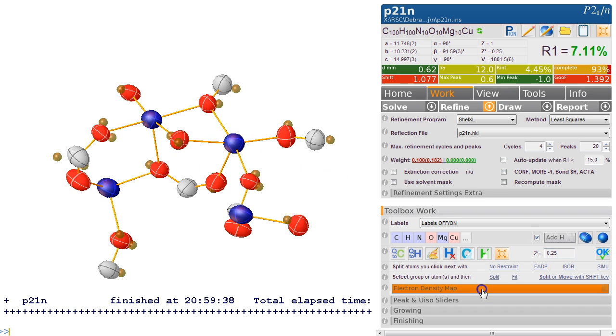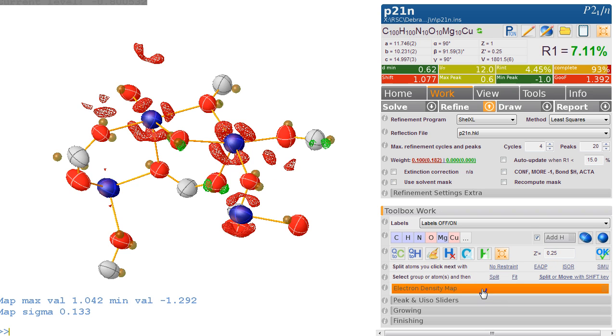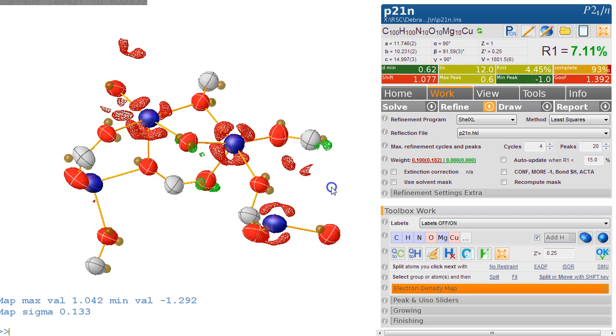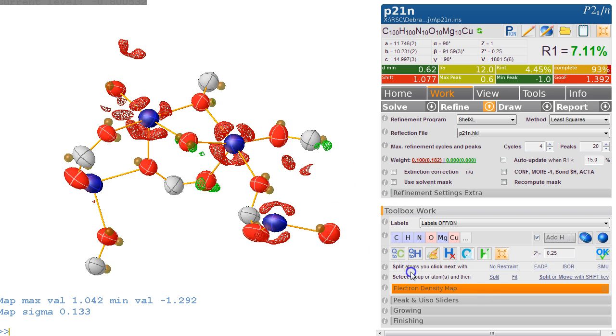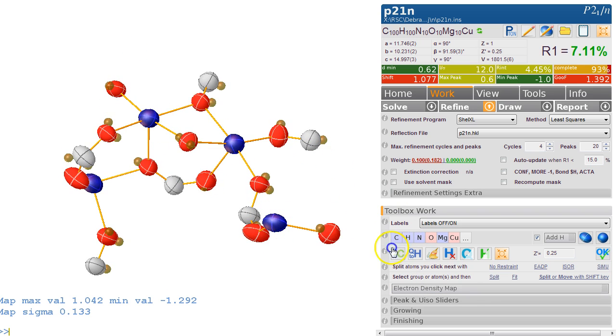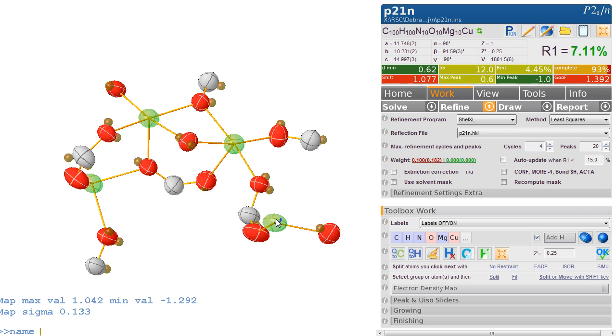We can look at the electron density map and yes, it does confirm it—there's too much electron density assigned here. So let's try for something obvious, maybe iron. So we go 'name Fe' and we refine this again.